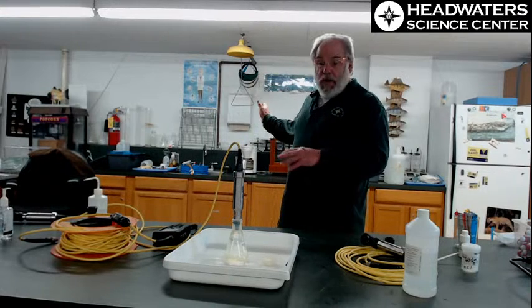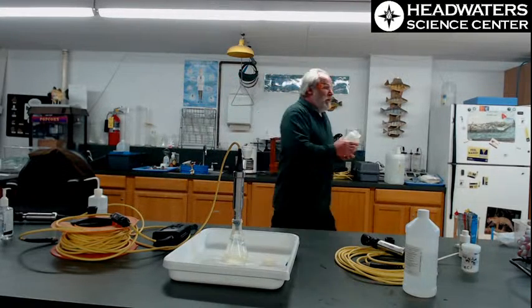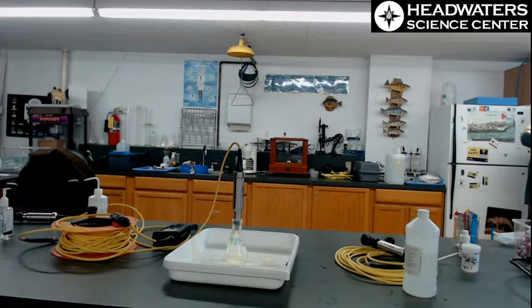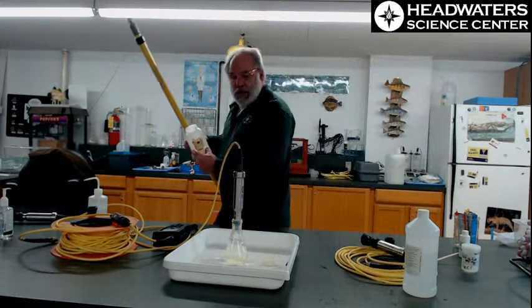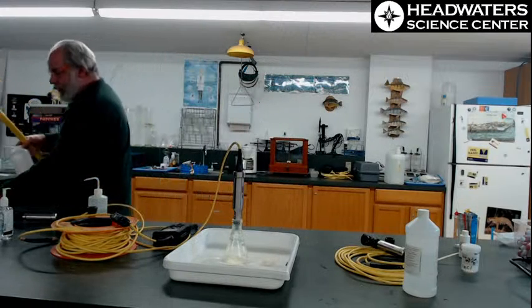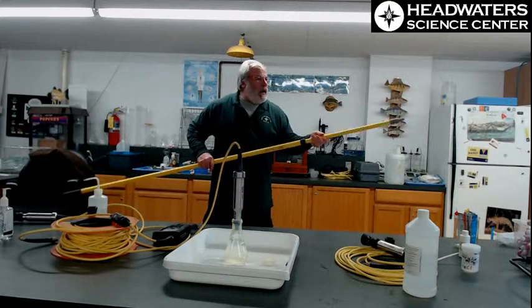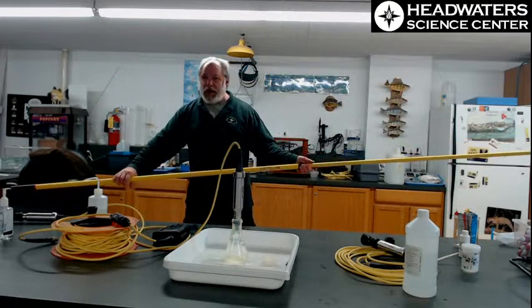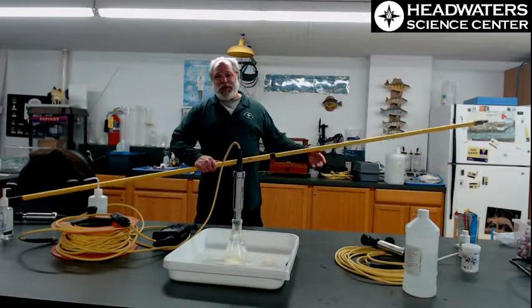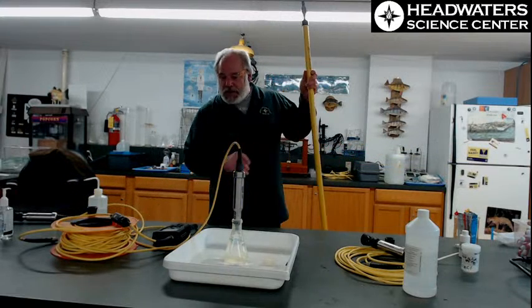We have two kinds of samplers here that we use. Essentially, we use that horizontal sampler, and then we use this pretty low-tech device, which is a stick and a bottle. This stick extends and connects up to the bottle, so if I want to get out into the water, I don't have to get my feet wet. One of the reasons we don't want to get into the water is because when we get in the water, we introduce ourselves to the water, so we can sometimes not get the true good sample that we wanted.